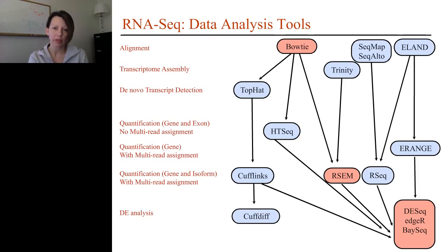But most of these methods are not appropriate for identifying differential expression at the isoform level, and so I'll spend some time today telling you why.